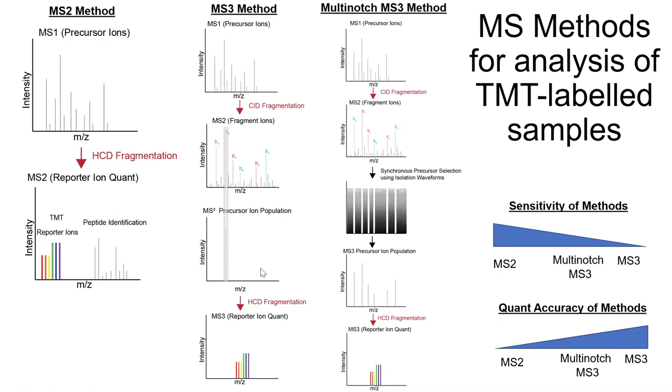Yeah, and I'll give a little bit more detail here. So in a chromatography separation on the mass spec, your peptide is actually going to elute over a time range that on average is maybe 10 to 30 seconds. And these scans are done in milliseconds. And so these are all millisecond time scales. So because of that, you can do an MS1 scan, identify your precursor, and then you can do the MS2 scan to break it initially, and then an MS3 scan, all within that 10 to 30 seconds when that peptide is eluting from the column.